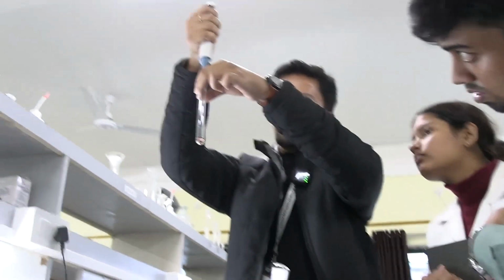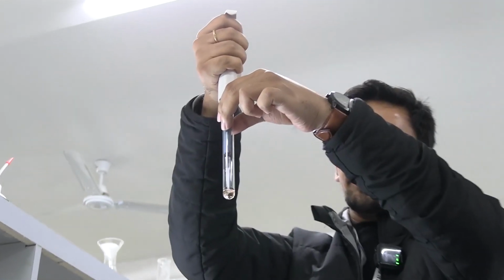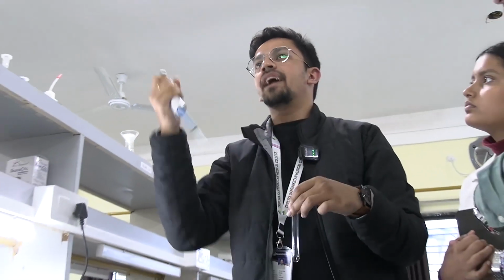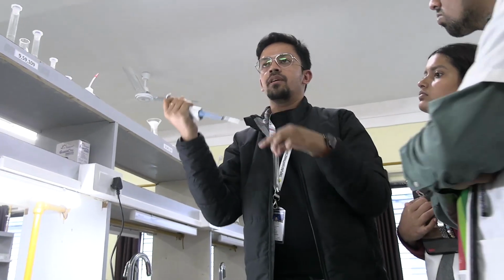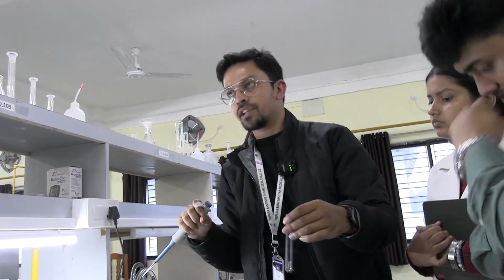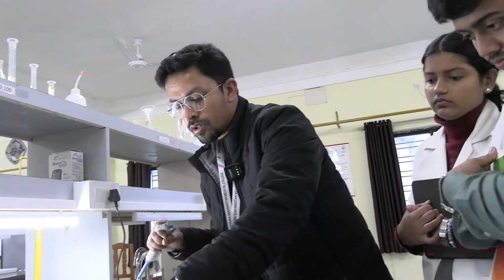Now see another process where I am putting the tip inside, releasing the sample. See, there is nothing, so there is a better way of mixture. Probably your hand is shaking, so somewhere this amount can get onto the wall and not get mixed at all. So don't do this kind of thing. If it is not mixing, then the test will not come. Okay, now this is done.